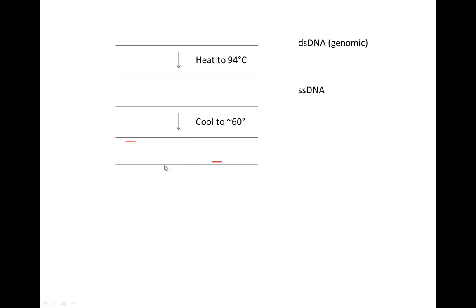We'll have a forward primer and a reverse primer in our reactions, and they are complementary to a specific site in the entire genome. There will be just this one site that this primer is complementary to the base sequence of the template DNA. And this primer will be complementary to this base sequence in this DNA. We'll talk a little bit more about that in lab down the road, not this week.